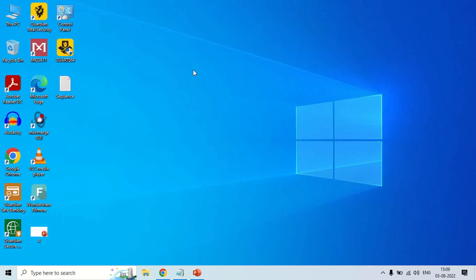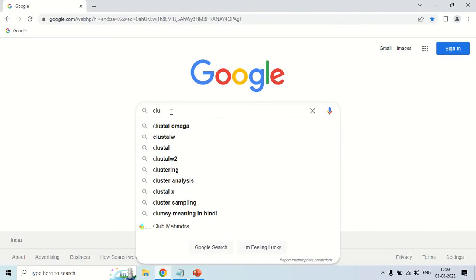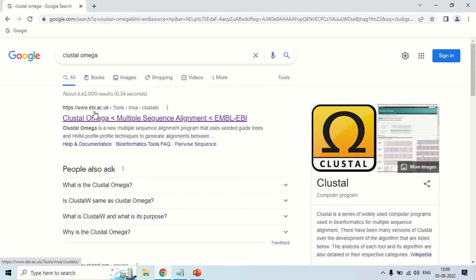Hello everyone. In this video, I will show you how you can perform multiple sequence alignment by using Clustal Omega. For performing multiple sequence alignment, just open your browser and search for Clustal Omega. As it appears in the suggestions, I am just picking it directly. Now this website is www.ebi.ac.uk/tools/clustalo — this is the official website of Clustal Omega.